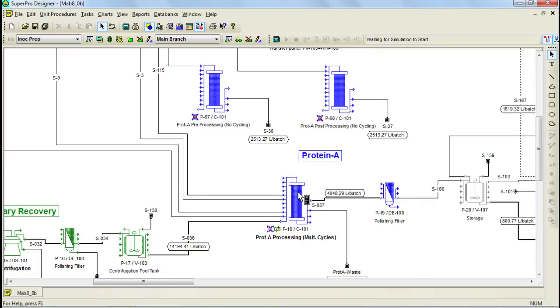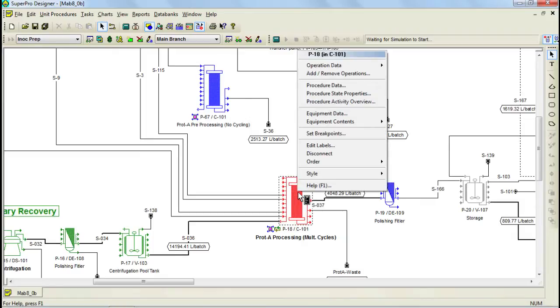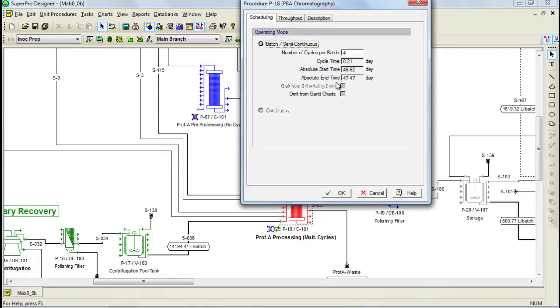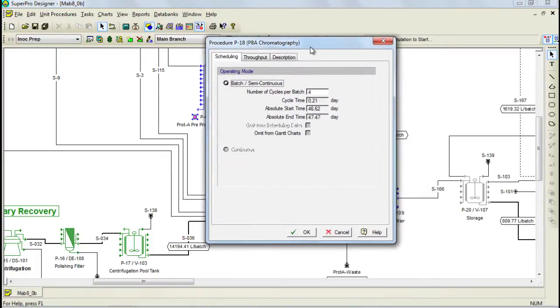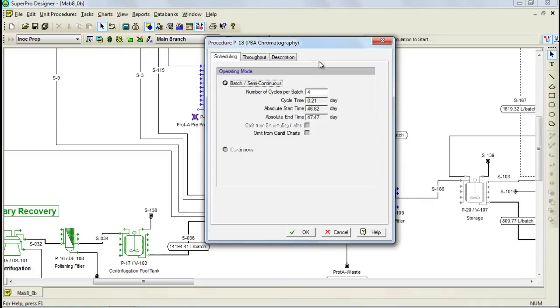To specify that a unit procedure operates in cycles, you need to right-click on the procedure and select Procedure Data from the menu. Then through this dialog, you can specify the number of cycles through this option. Notice that this unit procedure operates in a total of 4 cycles. However, when you add a new unit procedure, this number is 1 by default, so you need to change it if you want to increase the cycles.